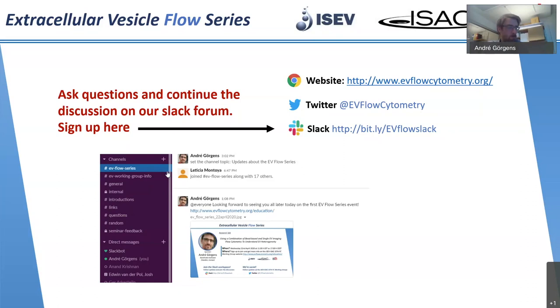Okay, I will ask one last question, and then I think André will follow up with your questions on Slack afterwards. We have quite a few questions here from Edwin. I'll just ask one or two of them that are related. How reproducible is the multiplex bead set in terms of coefficient of variation in fluorescent signals? Is there batch-to-batch variation? And would it make sense to standardize the measurements so that they're reproducible in terms of molecules of equivalent soluble fluorophore rather than just in arbitrary units?